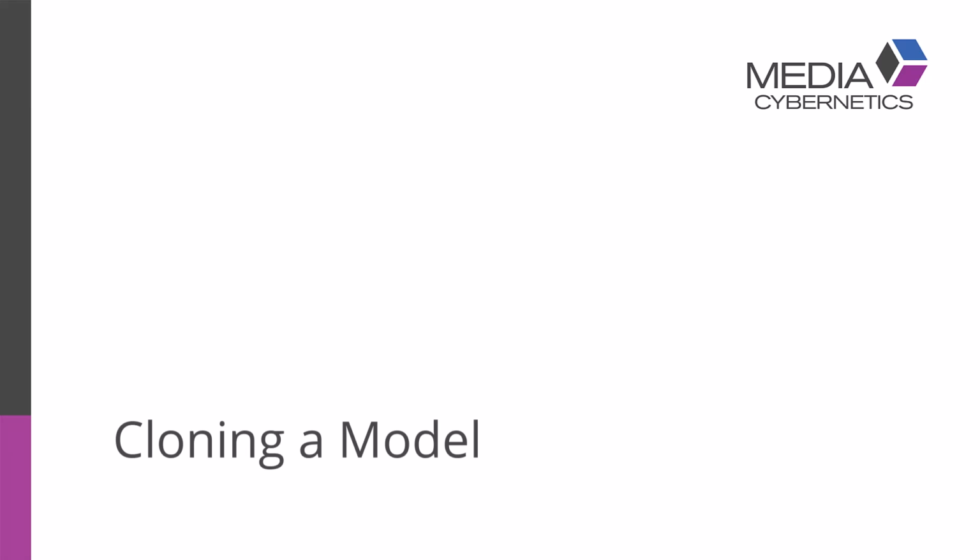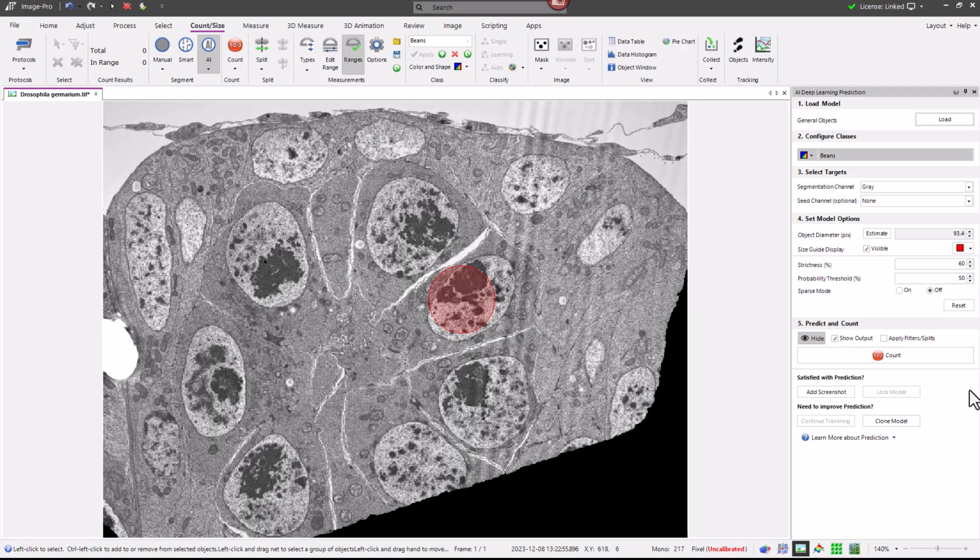In this video, I'm going to explain how to clone an AI deep learning model in ImagePro AI if you have the appropriate module. There are two methods for cloning an AI deep learning model. Once you have found a pre-trained model or other model appropriate for your sample and additional training is needed, you'll need to clone the model.